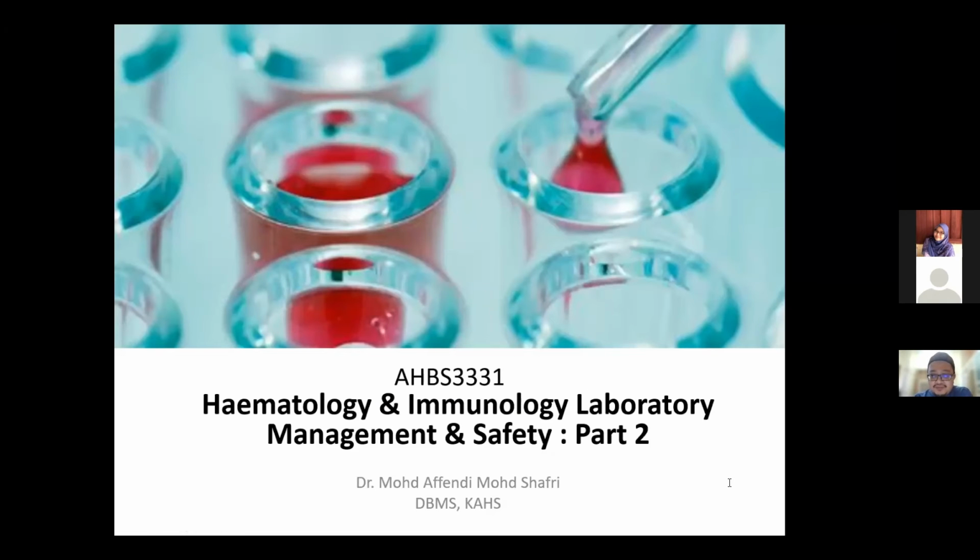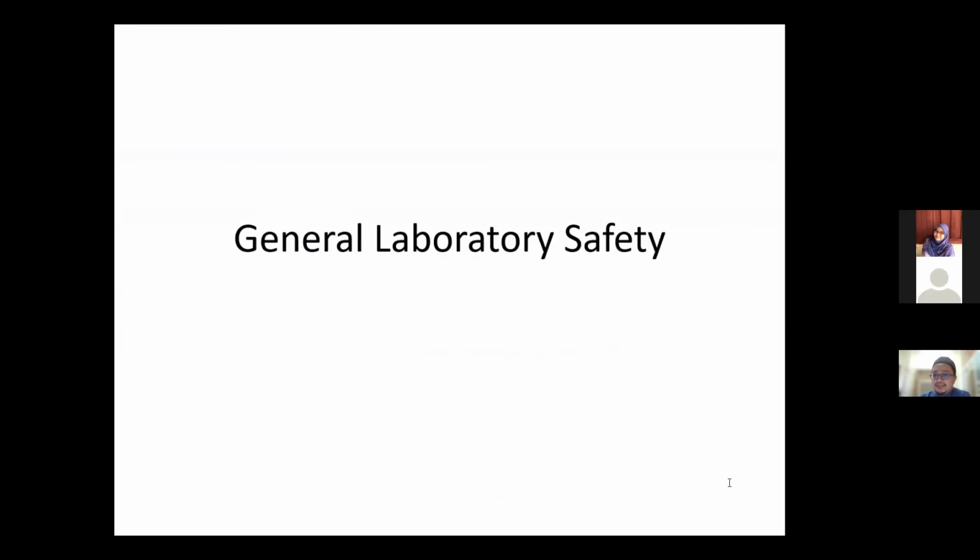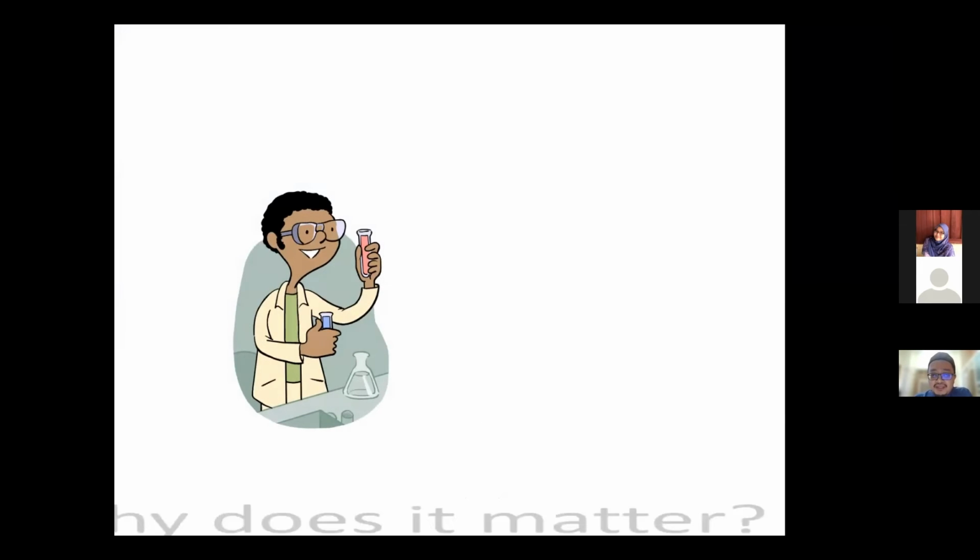So part 2 ni quite dry, I must say, and maybe you have had something similar. So we be quick and kalau tak habis pun tak apa. I have like another 60 slides. So it's the general lab safety.